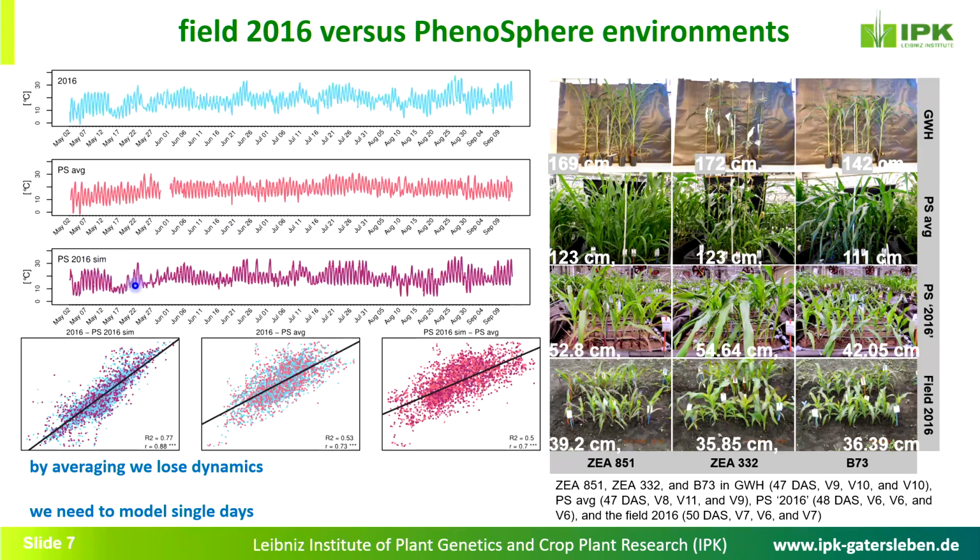For example, sometimes there are days with only low temperature or with only high temperature, and you introduce variation to which the plant has to invest into adaptation mechanisms, which obviously costs energy and then reduces growth speed and comes more into the field range. So I would say that amplitude is important, but also the patterning and the time orientation, which day comes when. I think this matters. So you have to check your target environment and then think about how to simulate that. Thanks. Thank you very much.